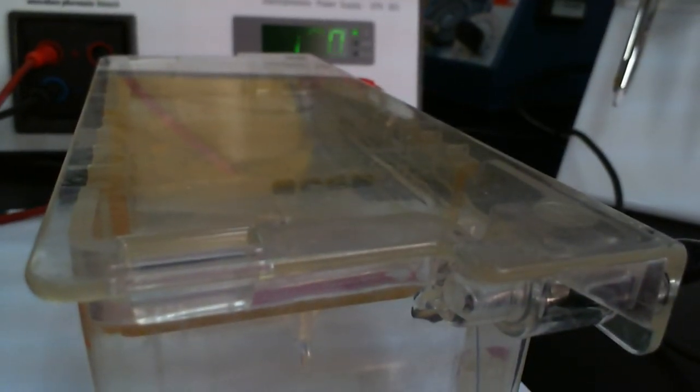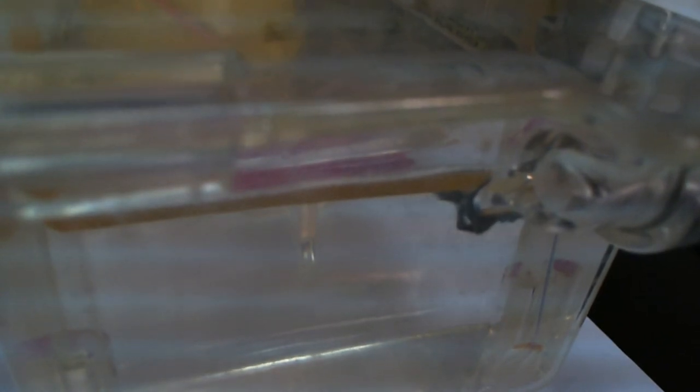Okay. Do not leave the apparatus. Do not leave the gel if you're running it ever without checking the negative electrode to make sure it's actually running. Sometimes the actual power supply will tell you one thing, but there may not actually be anything going through your gel. So make sure that the negative electrode actually is producing air bubbles, because that tells you that it is actually running.